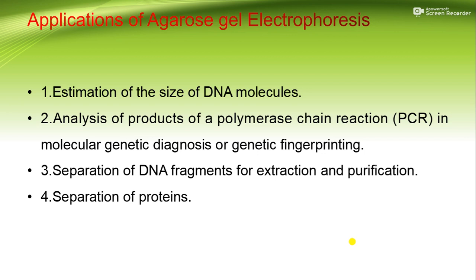Applications of agarose gel electrophoresis. 1. Estimation of the size of DNA molecules. 2. Analysis of products of a polymerase chain reaction, PCR, in molecular genetic diagnosis or genetic fingerprinting. 3. Separation of DNA fragments for extraction and purification.